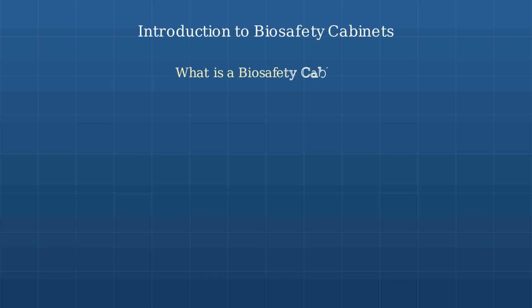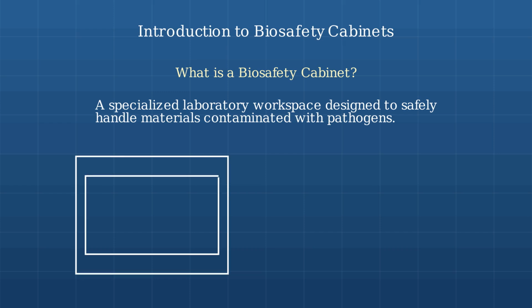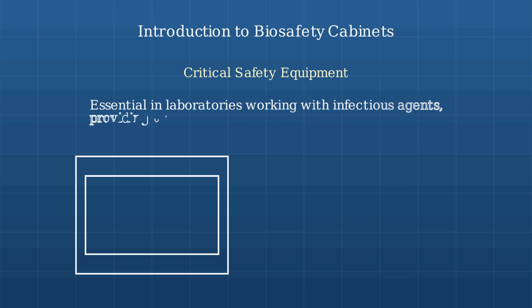A biosafety cabinet, or BSC, is a specialized laboratory workspace designed to safely handle materials contaminated with or potentially contaminated with pathogens. These specialized enclosures provide a controlled environment that minimizes the risk of exposure to hazardous biological materials. Biosafety cabinets are critical safety equipment in laboratories working with infectious agents. They are an essential component of laboratory biosafety programs.